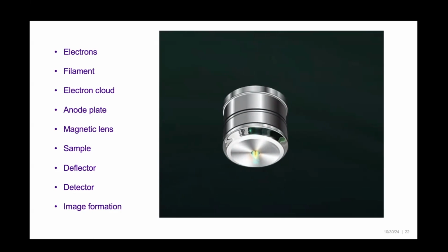Now, if you increase the voltage, then in this region we start to get a thick cloud of electrons, because as you increase the electric current and increase the accelerating voltage, you push electrons away. Now they can pop out of this wire. If there is a very high accelerating voltage, you start to make a cloud of electrons. That's why there is an electron cloud. So the property of electrons, how they react when you have electric current, is used, with a filament and electron cloud.